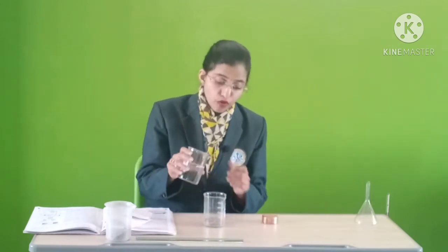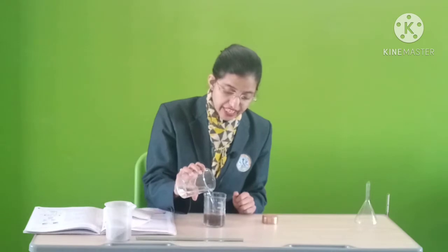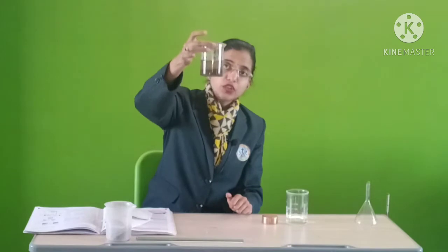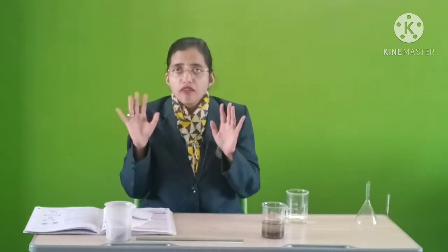Insoluble impurities like sand can be removed from water by the process of sedimentation. I have mixed sand with water — this is the mixture. Now I am going to remove sand from this. I will keep this beaker here for some time, and after some time the sand will settle down at the bottom.